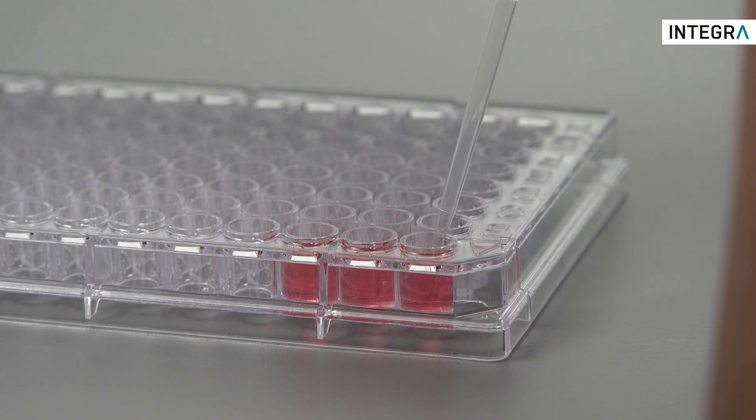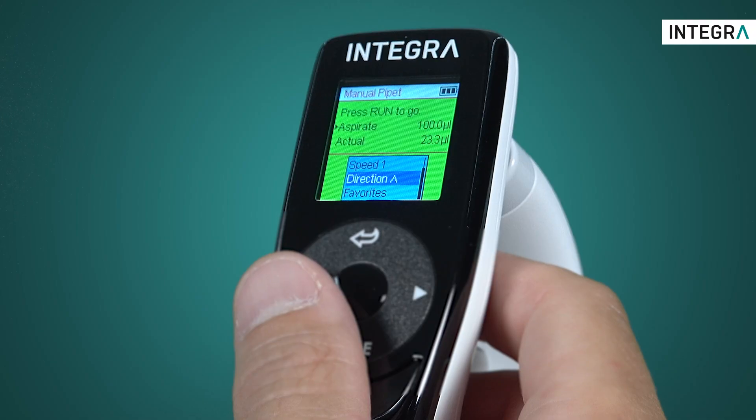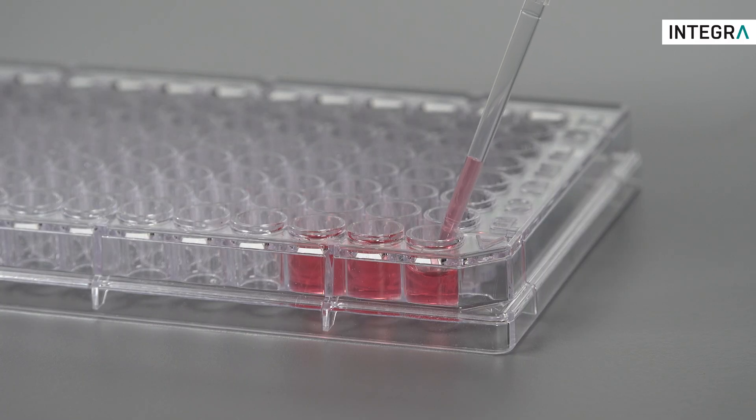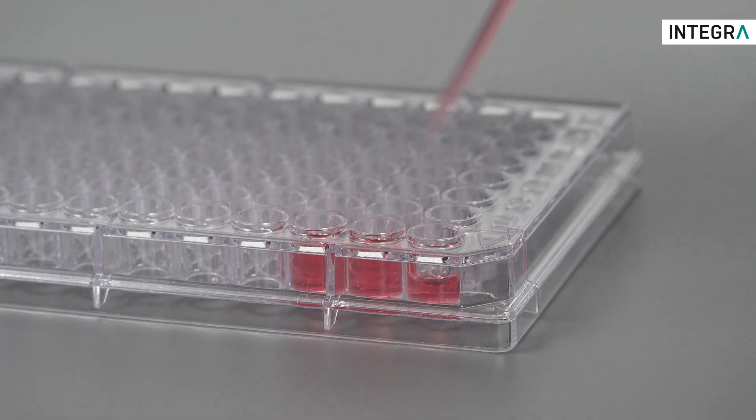Enter the liquid with the pipette and every time the run button is depressed the liquid will slowly be aspirated. A quick look at the screen confirms just how much has been aspirated. For larger amounts of liquid, simply hold the run button longer. This is great for controlling the aspiration of, for example, a supernatant without disturbing the pellet or beads.